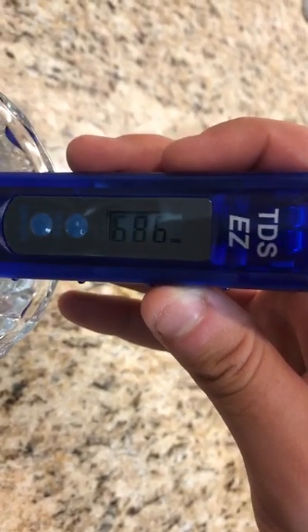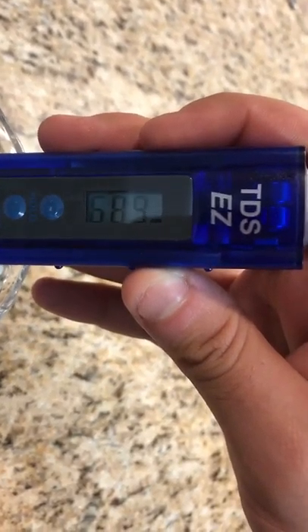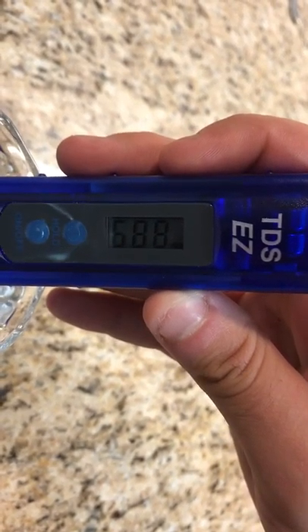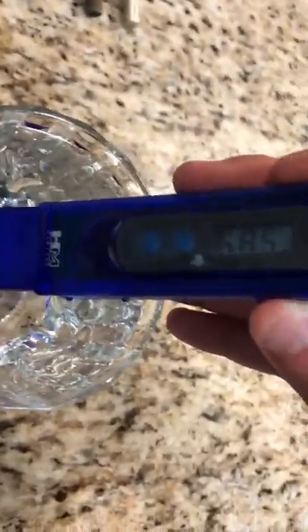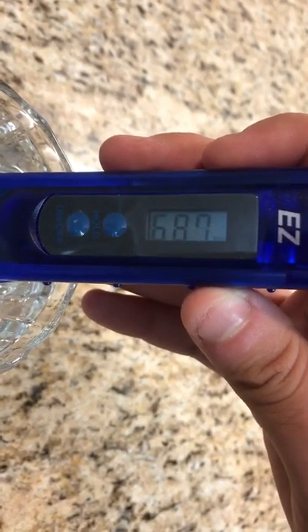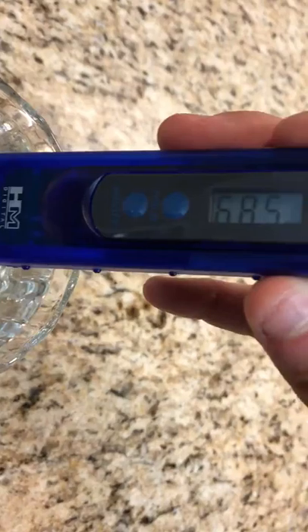In essence, there are 689 particles of harmful dissolved solids in the water for every million particles of water. Ideally, no one should be drinking this water because it is too contaminated and not suitable for drinking. Now that that part of the experiment is over, we're going to use an electrocoagulator to further solidify the point.